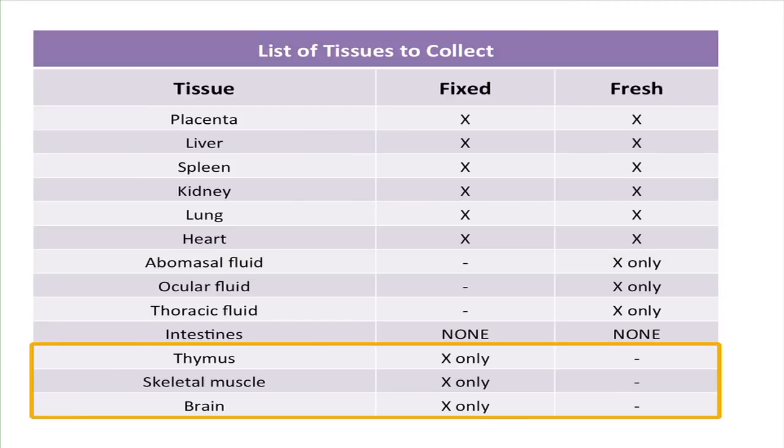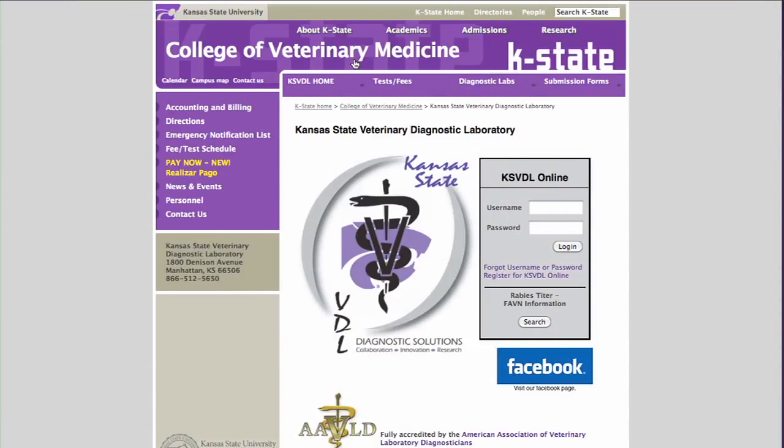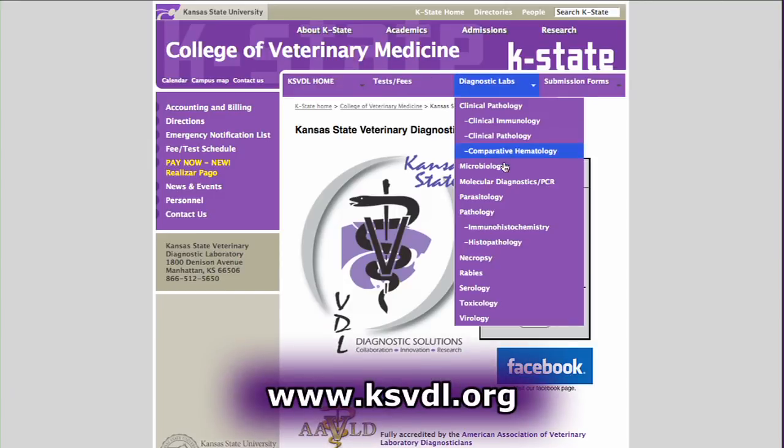The three tissues that should be submitted as fixed only are the thymus, skeletal muscle, and the brain. Please remember that all fixed tissues except the brain need to be no more than one centimeter in thickness for proper fixation to occur. This table can be found on the Kansas State Veterinary Diagnostic Laboratory website under Diagnostic Lab and Necropsy.